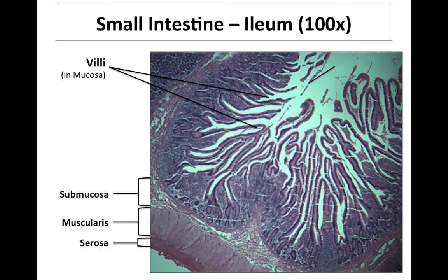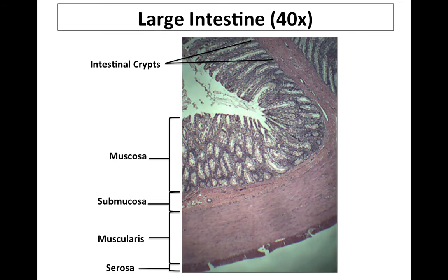If we're pointing to the mucosa, make sure you can tell us that all along the mucosa of the small intestine you should see simple columnar epithelium, and you should be able to acknowledge any additional glands or structures that are found within these tunics. So of course, as food passes from the small intestine into the large intestine, you see functions change.